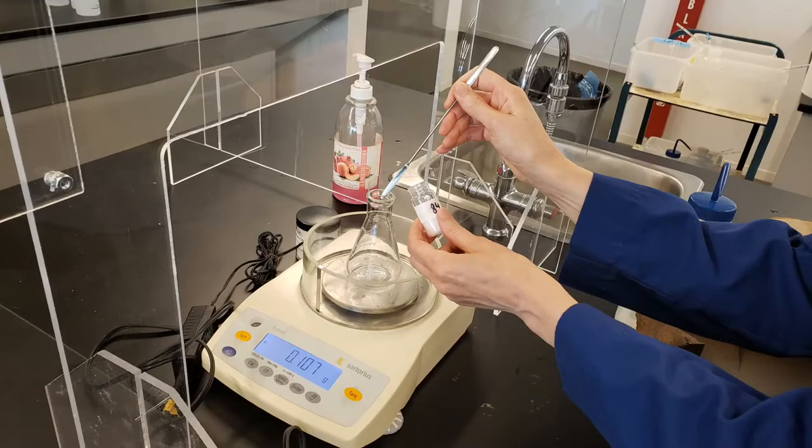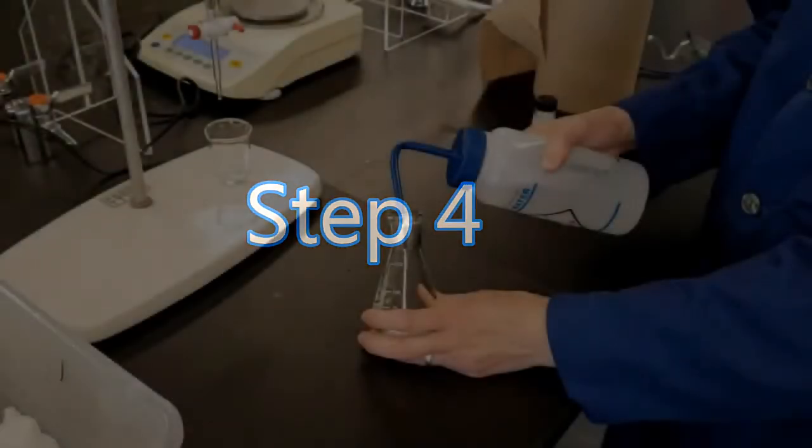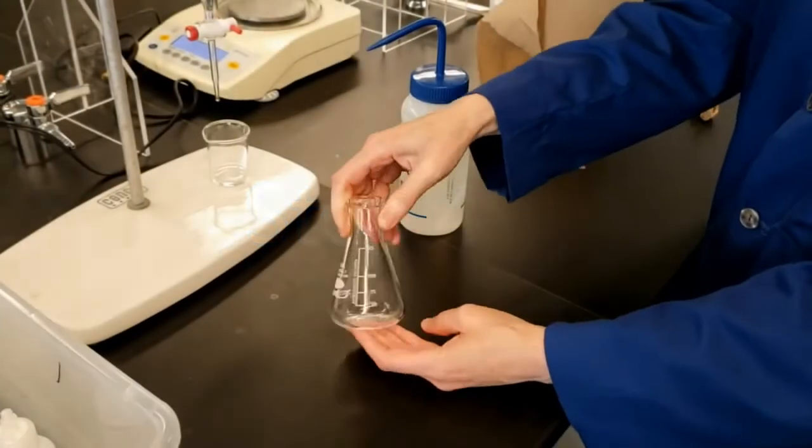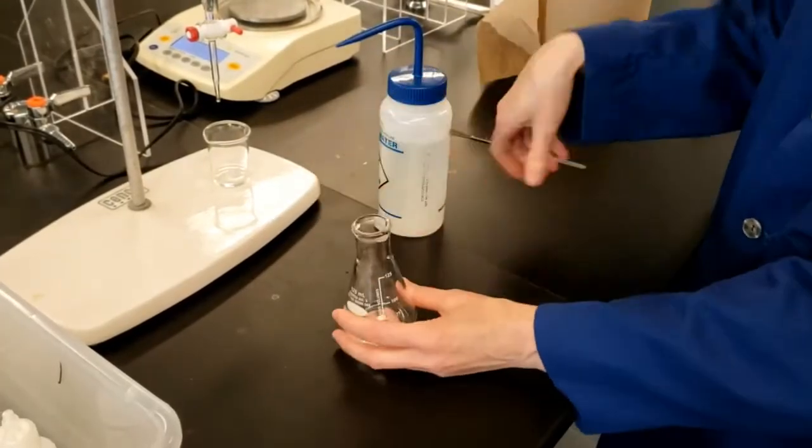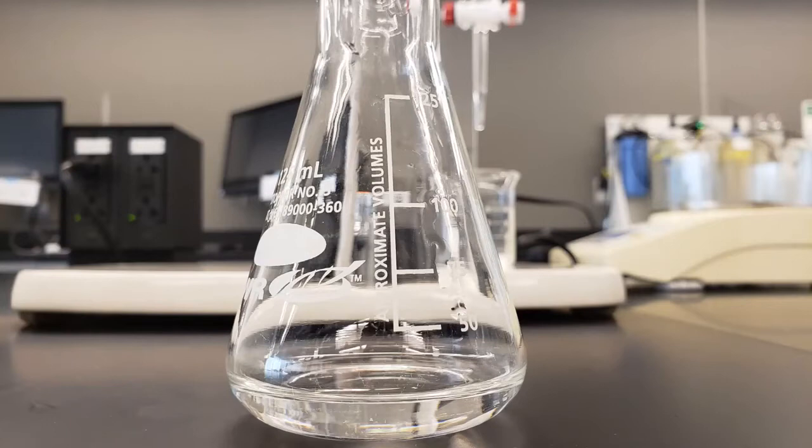Add approximately 20 milliliters of deionized water and swirl the mixture gently. Make sure no solid acid particles remain on the side of the flask. The acid crystals may not dissolve completely at first, but this will not affect the titration results. Add 2 drops of phenolphthalein indicator solution to the acid in the flask.